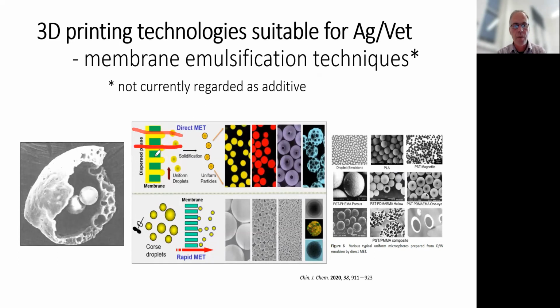That means forcing a material through a size dependent restricted membrane to create very precise microparticles, giving very tight particle size distributions and very uniform microcapsules. This is as opposed to the typical beaker, vat, vessel, solvent evaporation emulsification, where you can get some very ugly, variable constructs more often than not.